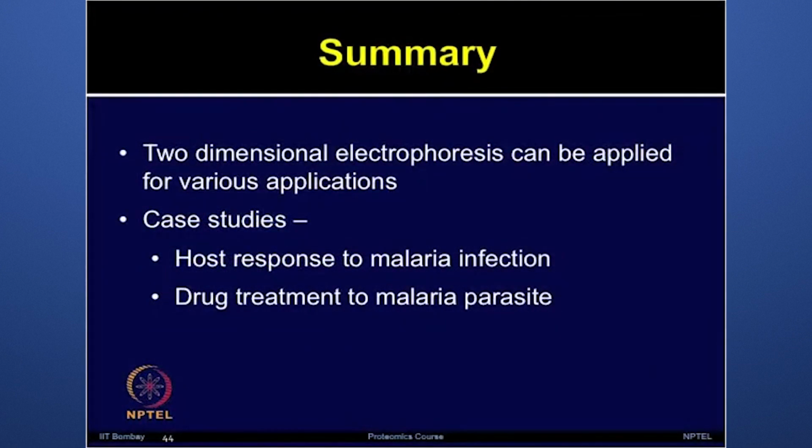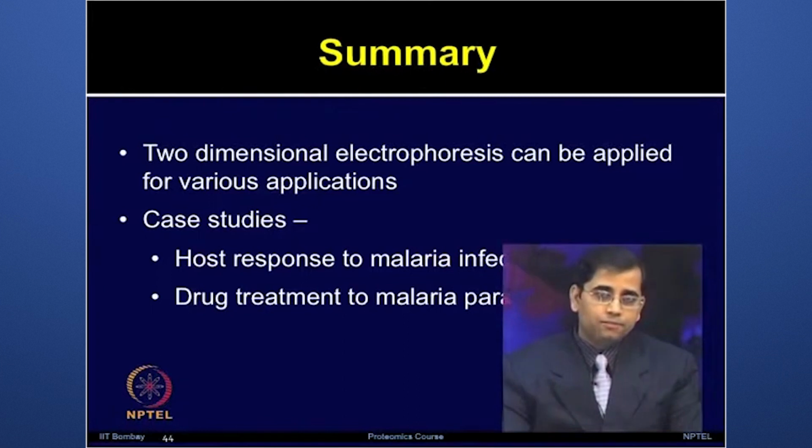Today we talked about how the two-dimensional electrophoresis technique can be applied for various biological applications.